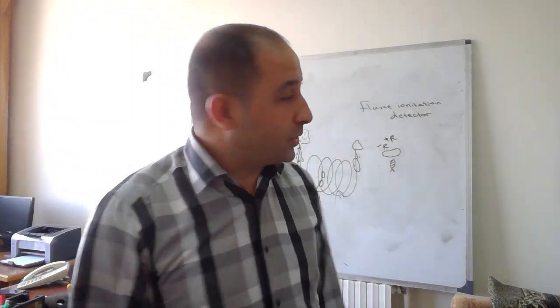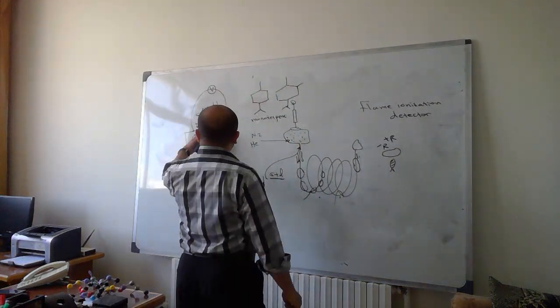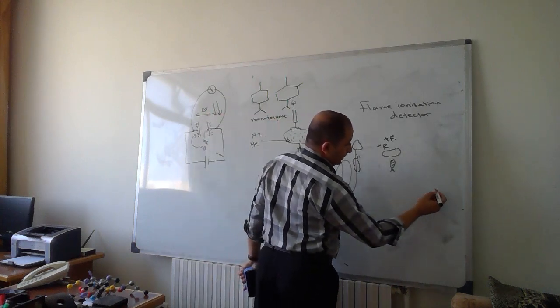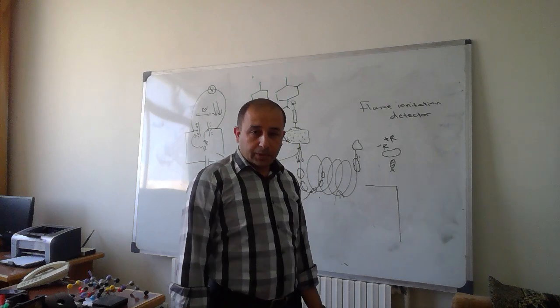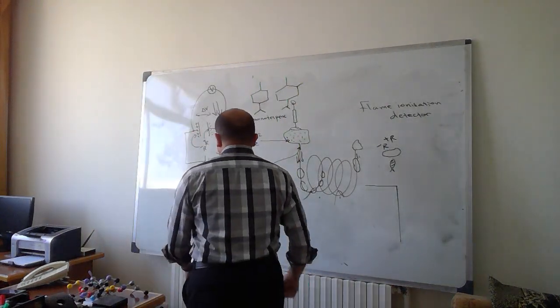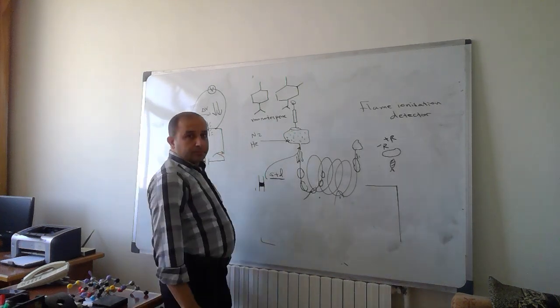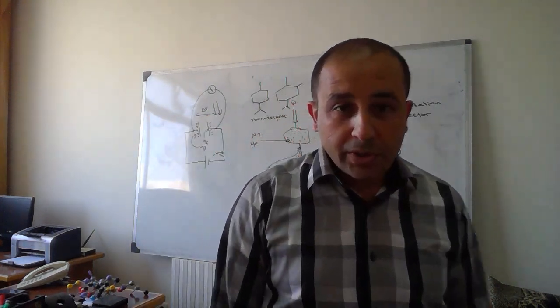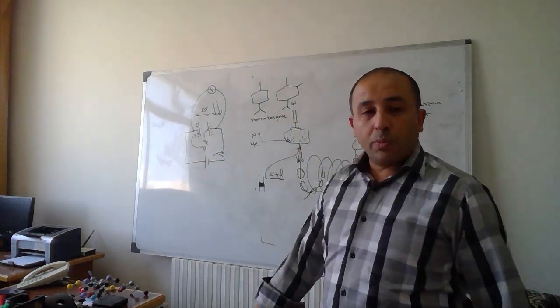So once we reduce the charge, the voltage will be reduced. And if we close the circuit, this reduction will be proportional to what? To the cloud of analytes.